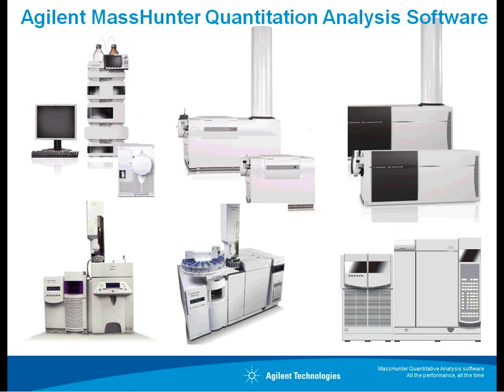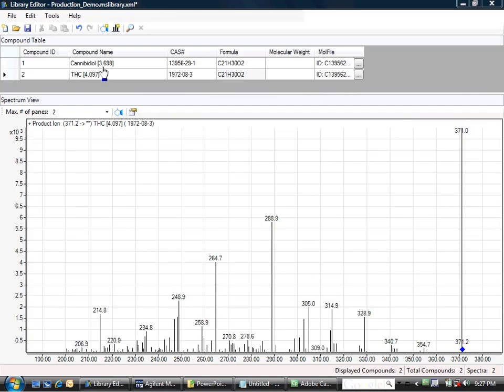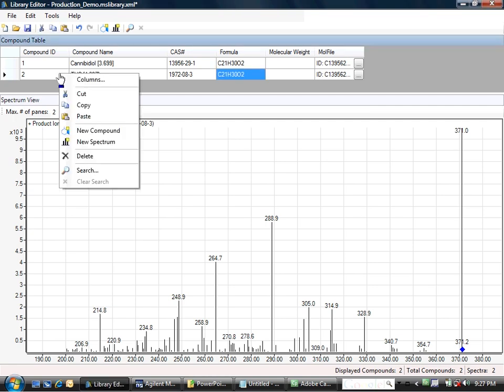Alright, let's take a look at the library editor and discuss the ability to create custom libraries. In this case, we'll use Quant and take spectra from Quant and create a product ion scan library. Here I am in the library editor. I've already entered a couple of compounds, Cannabidiol and THC. I would like to enter another compound at this moment, so I will right-click and say New Compound.